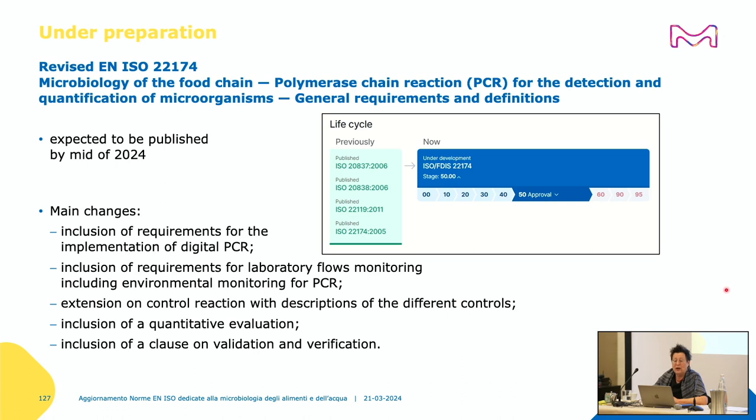And the main changes are that we have now included the requirements for the implementation of digital PCR. Very good. At the last minute we have implemented inclusion of the requirements for the laboratory flow monitoring, including the environmental monitoring for PCR, extension of the control reactions and description of the different controls, inclusion of a quantitative evaluation, and inclusion of a clause on validation and verification. Of course, with reference to the ISO 16140 series.